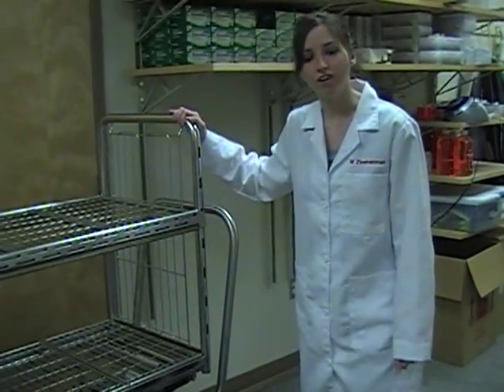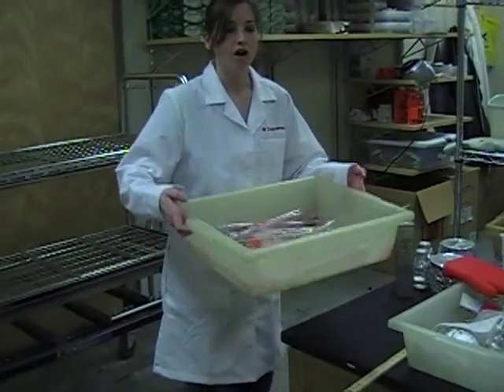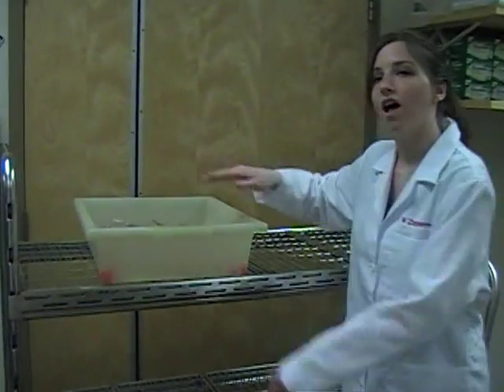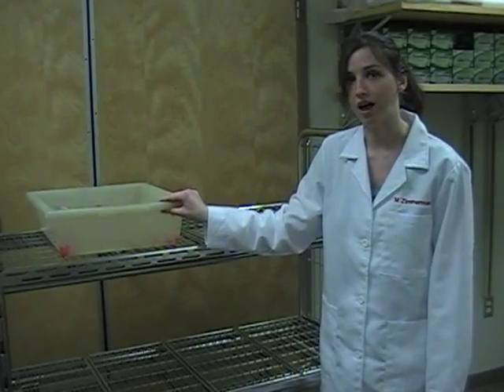In order to use the autoclave, you have to make sure that what you're using is autoclavable. These thick pieces of metal and plastic are able to withstand the high steam pressure of the autoclave. Autoclave temperatures reach about 121 degrees Celsius typically, so you have to be very careful about the type of plastic you use.